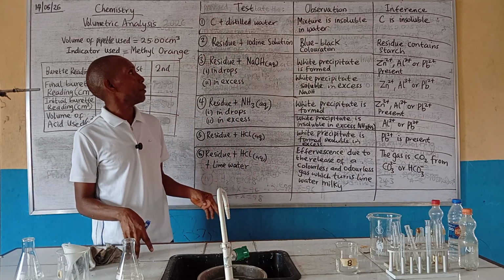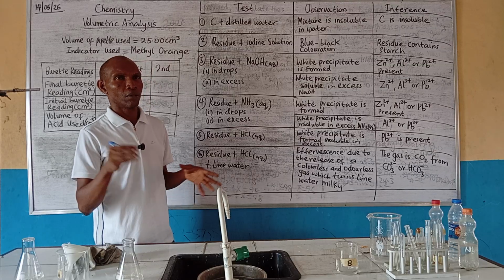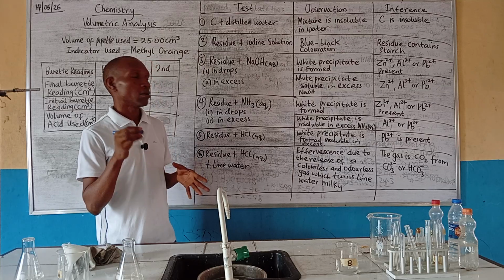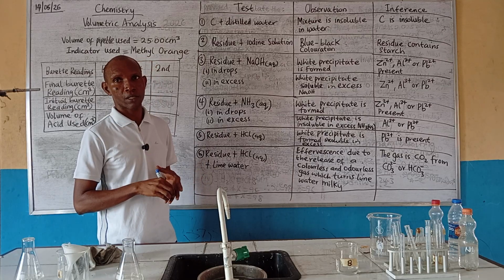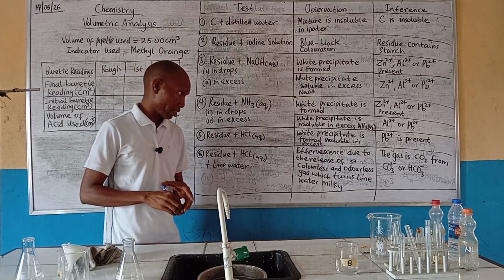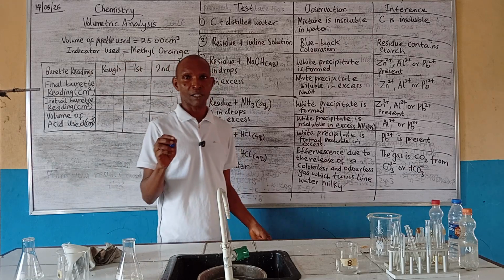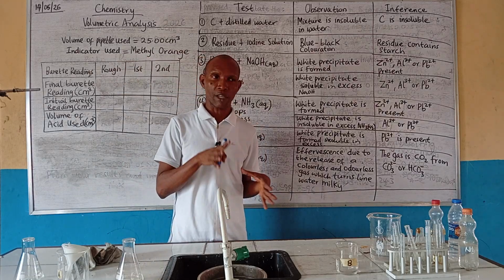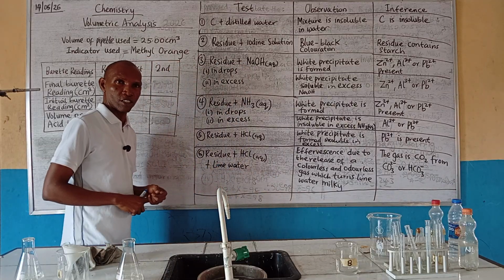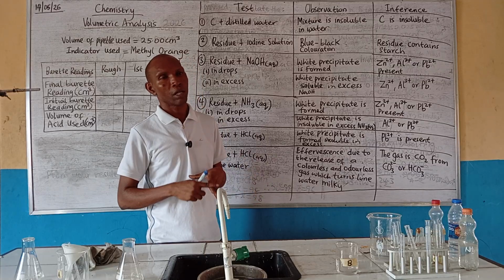Today we are taking a look at the qualitative analysis for this year's WAEC SSC 2026. So don't forget that there are two substances involved in this year's qualitative analysis practical. We have lead carbonate and starch. Lead carbonate and starch.